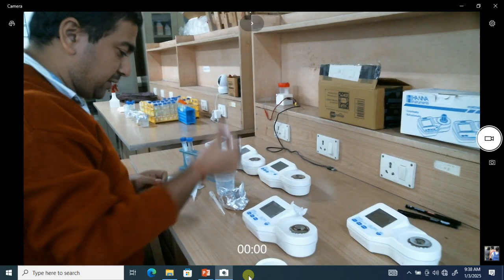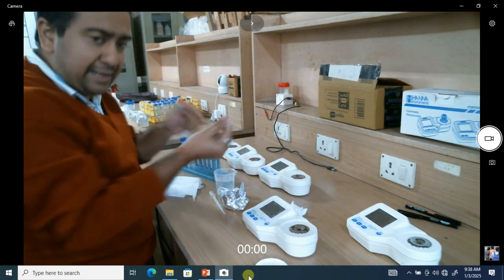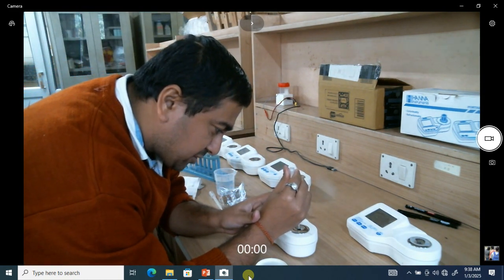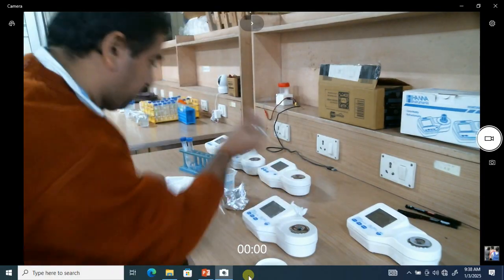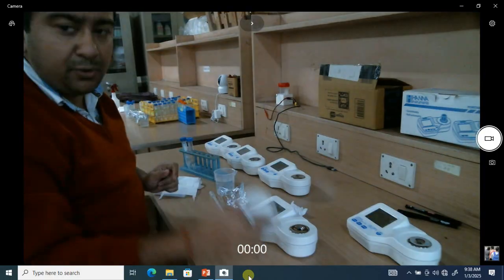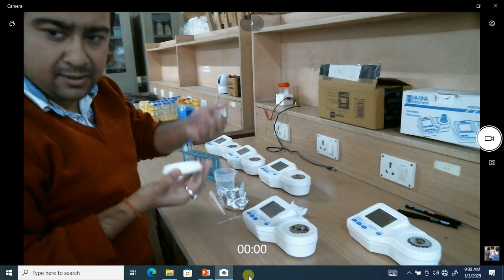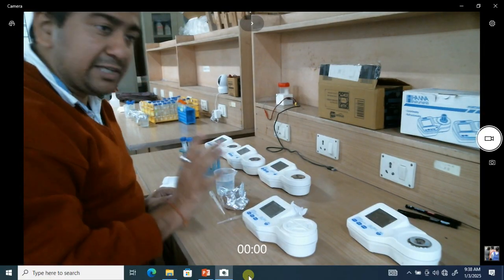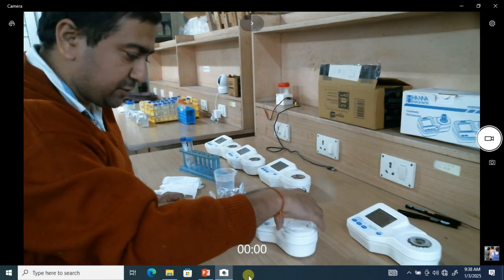Again the same procedure. We'll take a dropper, take the distilled water, exactly at the center, only 2 to 3 drops, not more than that. Very slowly and carefully. The next step is to insert the cap, which is placed at the bottom of the instrument. Now we will simply go for 0 at first. 0 is done.